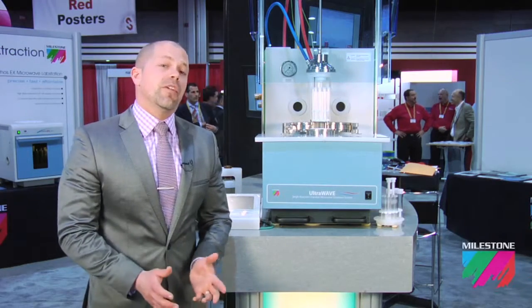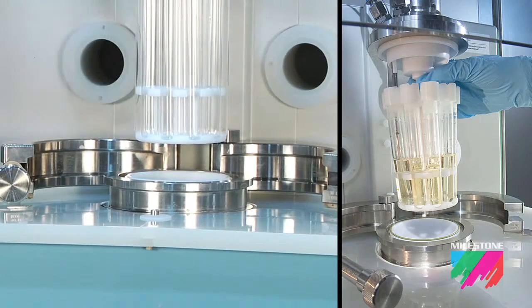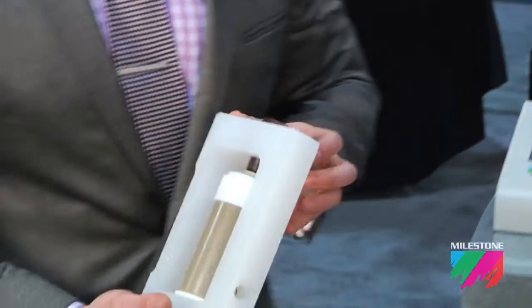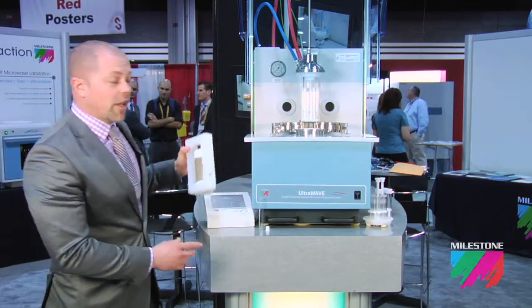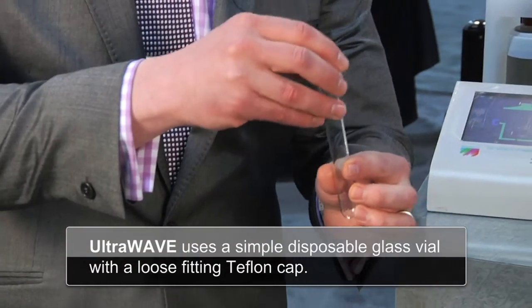Unlike traditional microwave digestion systems, the Ultrawave uses a single reaction chamber where all samples are processed under the same temperature and pressure conditions. This is a traditional closed microwave digestion vessel. In the Ultrawave, using SRC technology, we use a simple disposable glass vial with a loose-fitting Teflon cap.